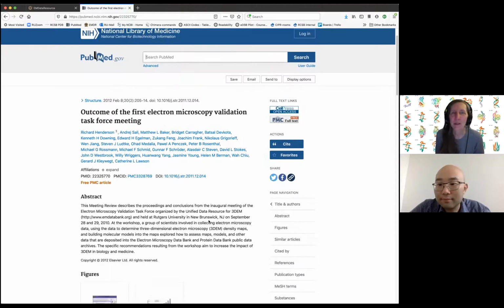Some of the key things were, I think the idea of the gold standard FSC was created by Steve Ludtke chiming up during the discussions at that meeting, and then with some agreement of other people.